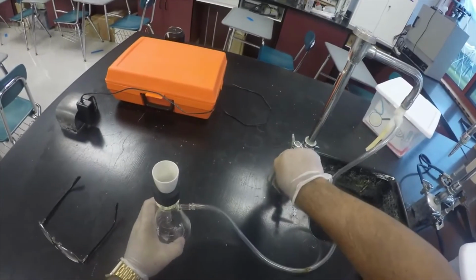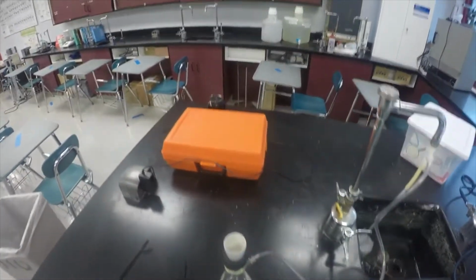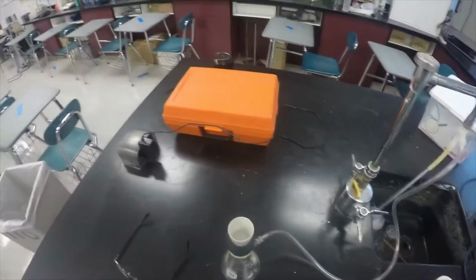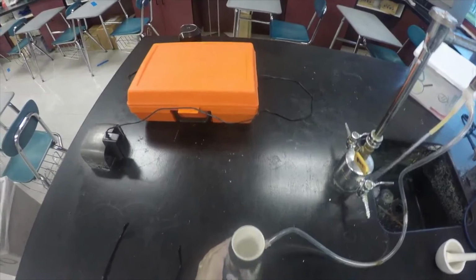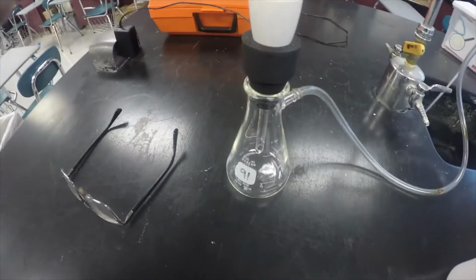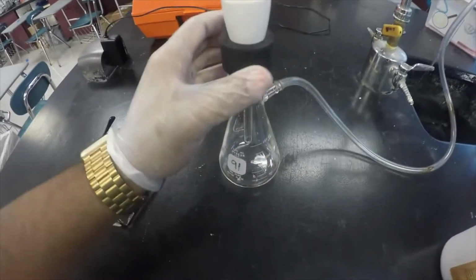I'm going to turn the water on, and before I start, I want to get this filter wet a little bit so it forms a seal, so the calcium carbonate shouldn't be pulled through. I'm just going to wet the filter paper a little bit. Notice how the liquid is being pulled through the Gooch crucible. That is the effect of the vacuum that's created by the aspirator.